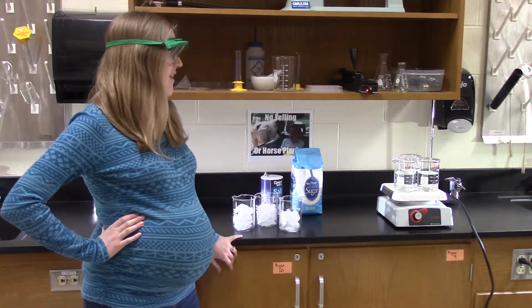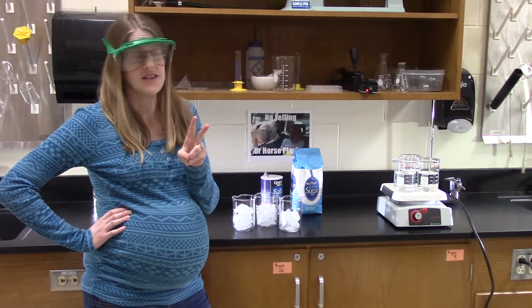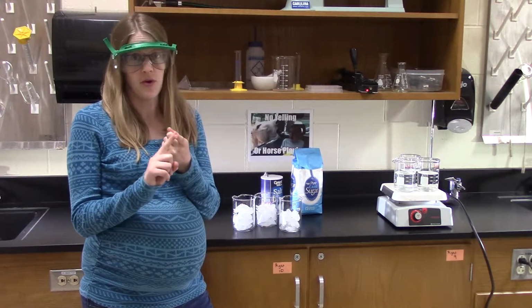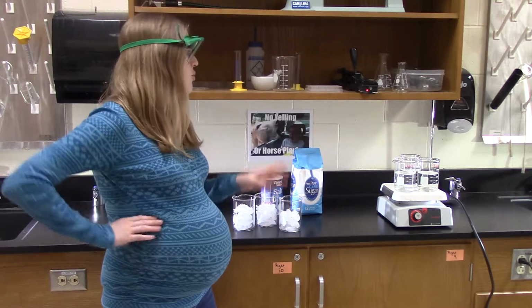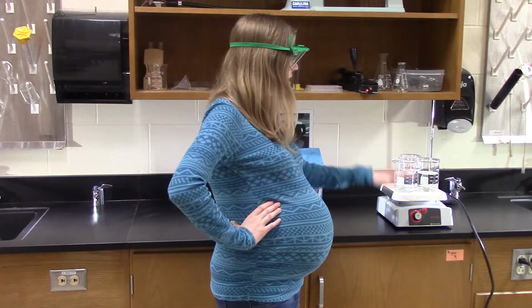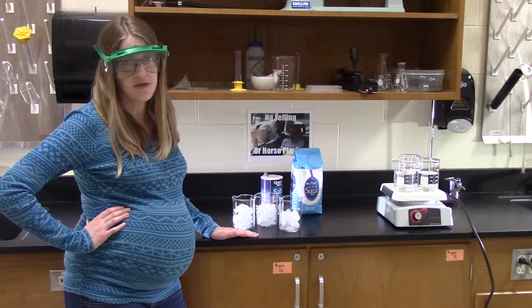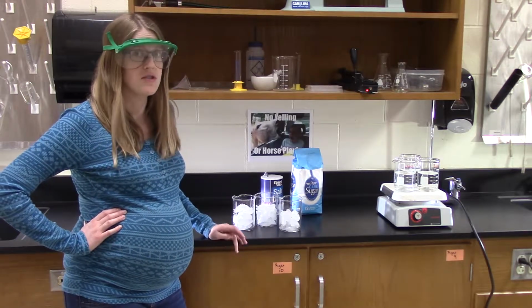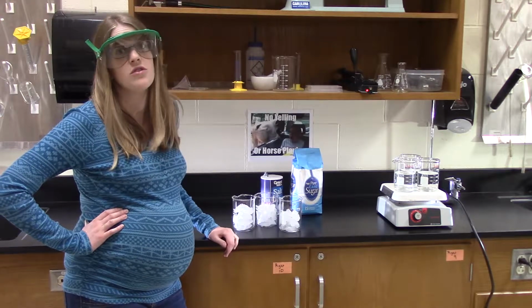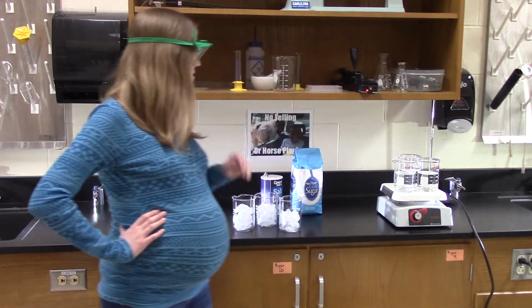So I'm going to particularly talk about two different colligative properties: increasing boiling point and lowering the freezing point. So we've got some water here that I'm getting ready to heat up so that it will start boiling. And I've got some ice here that I'm going to allow to melt. But you remember that if we add a solute to the water, it's going to affect the boiling point and it's going to affect the melting point.